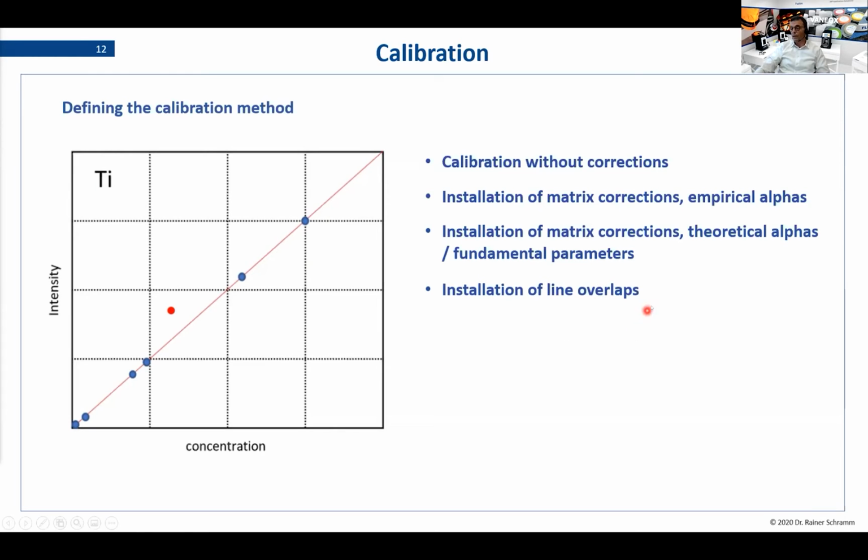Then you have to look at line overlaps, and of course, at any outliers in your calibration.